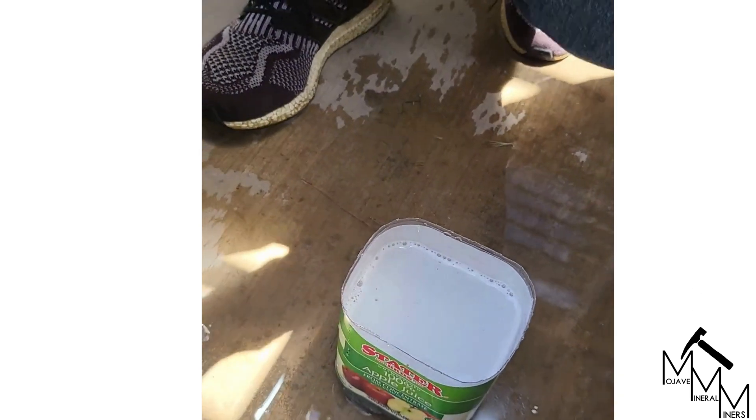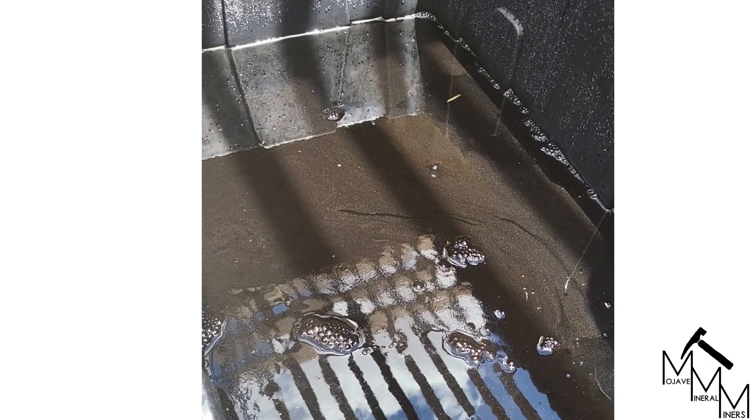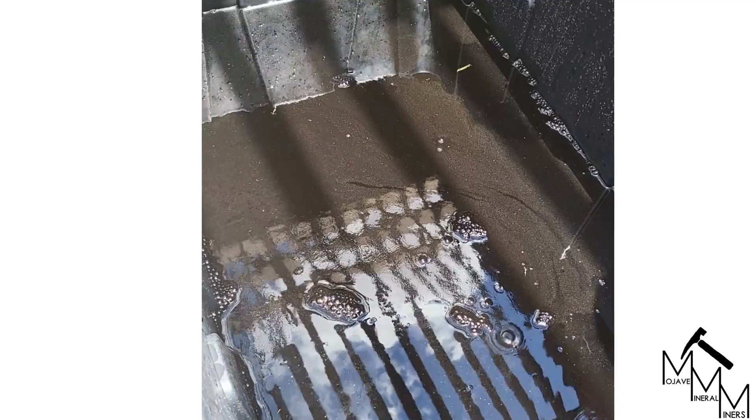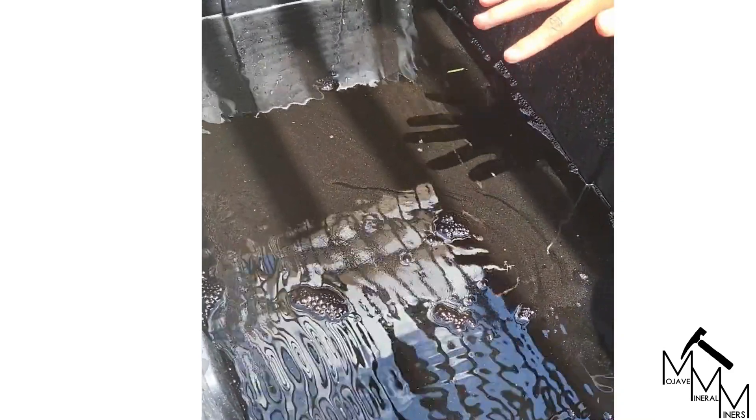This solution is currently diluted to about one percent sulfuric acid. We're going to neutralize it a little more, fill it up a bit more, and then it will be dispersed into the sewer safely.